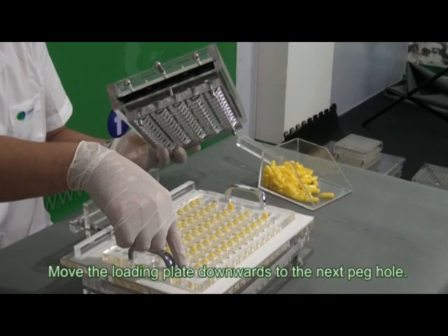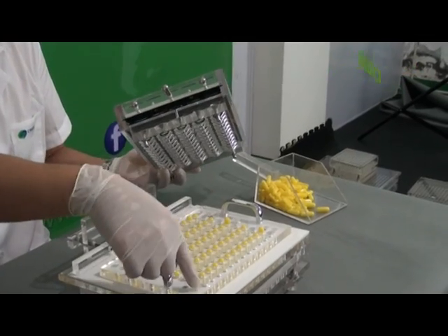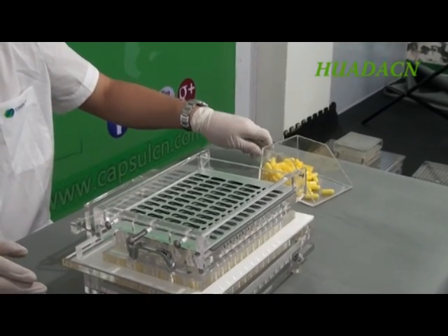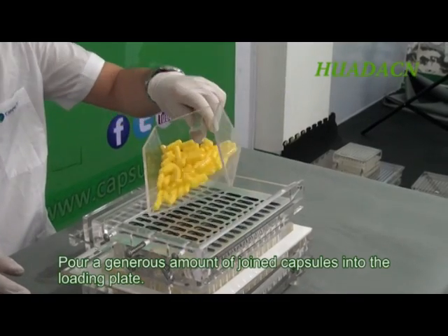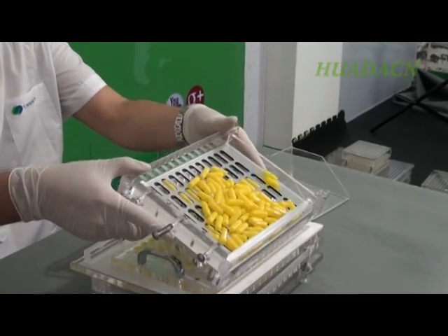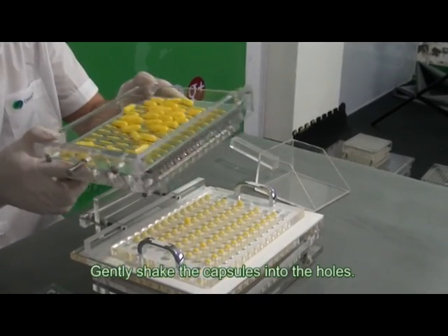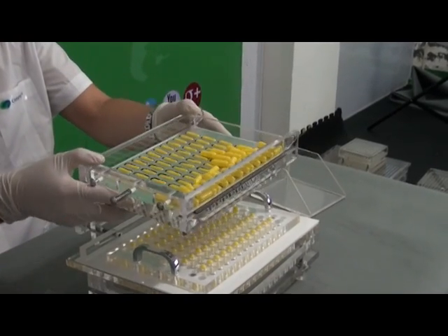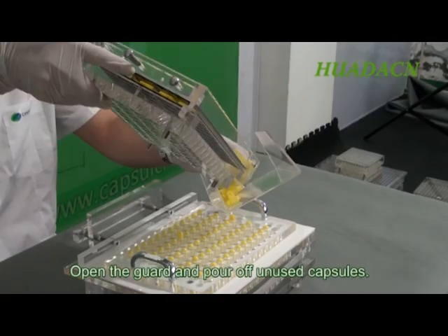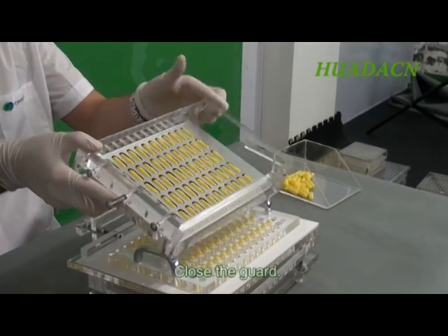Move the loading plate downwards to the next peg hole. Pour a generous amount of capsules into the loading plate. Gently shake the capsules into the holes. Open the guard and pour off unused capsules. Close the guard.